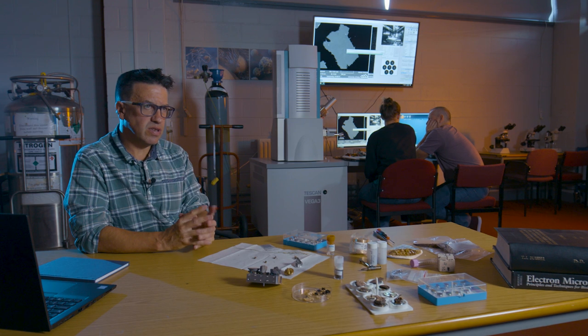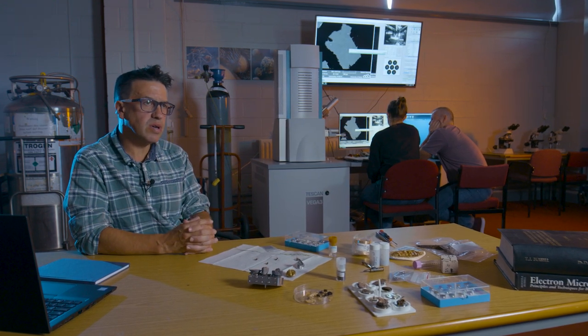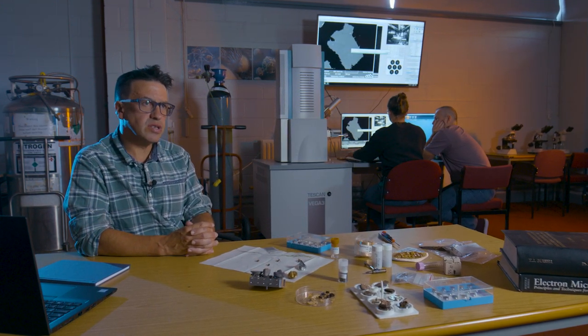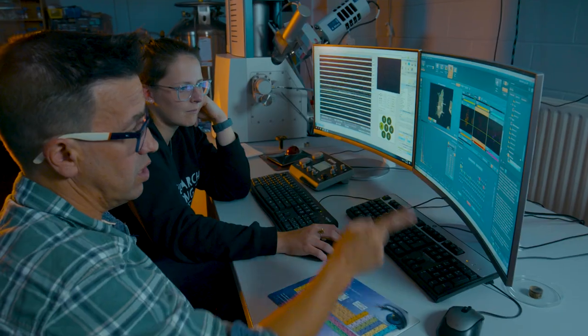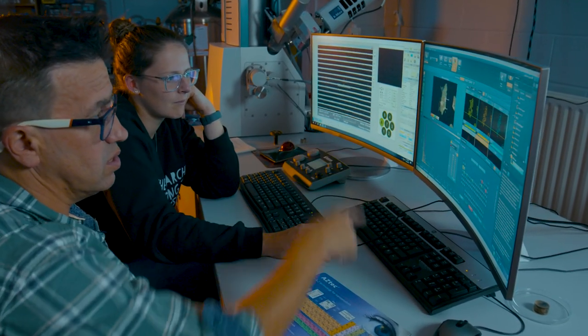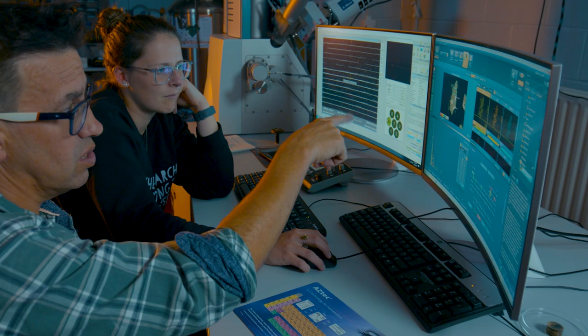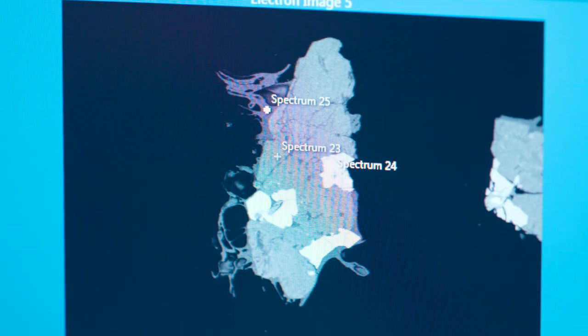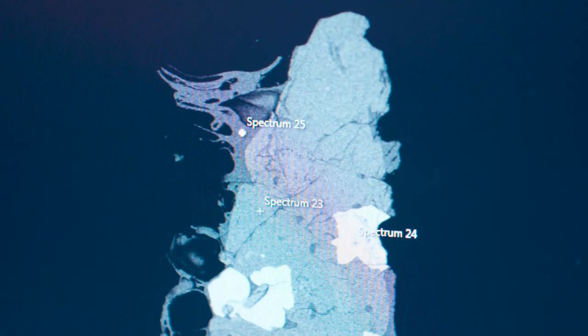One of the main benefits of this machine here at the University of Derby is that this is accessible to all. So from undergraduate level through to researchers, through to commercial usage, anybody can come and use this and be trained if necessary.